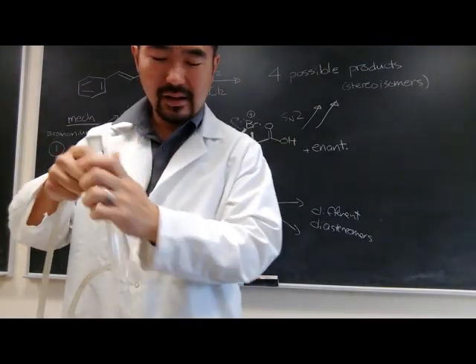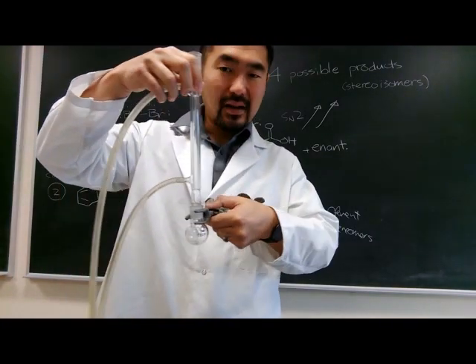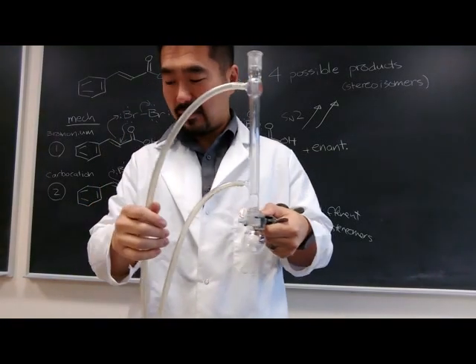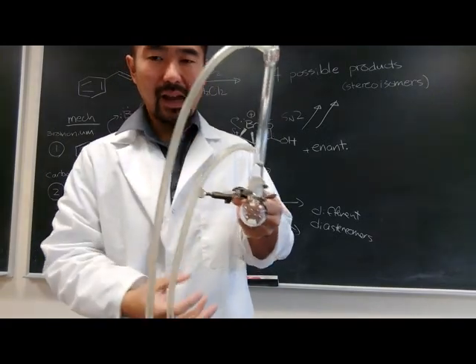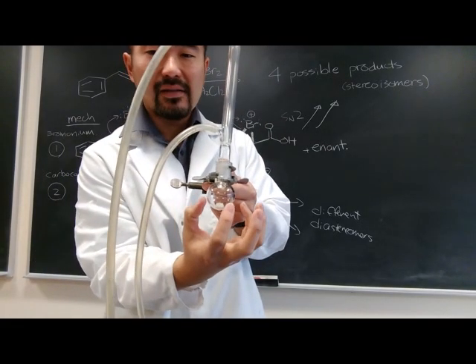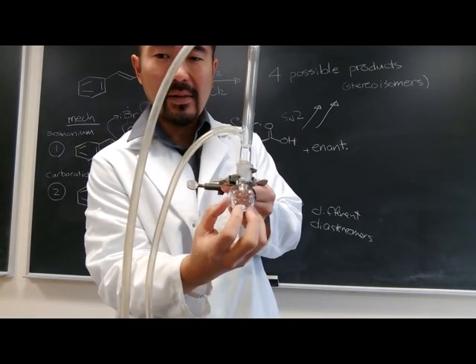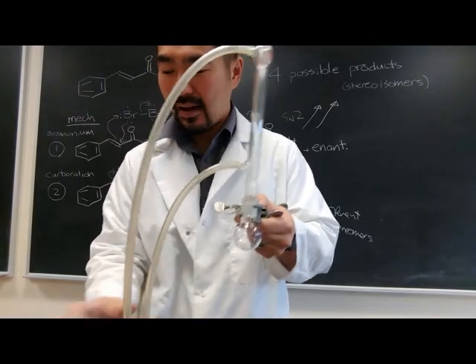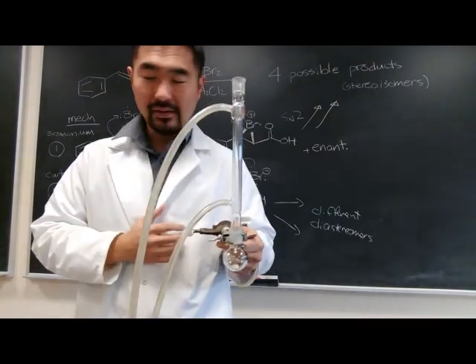And now, once you take care of the plumbing for this, you can place the condenser on top of your flask, and this should be secure enough for the entirety of the reaction. It has to be tall enough to at least about halfway immerse this round bottom flask into that hot warm water bath, and that's how you set up your reaction.